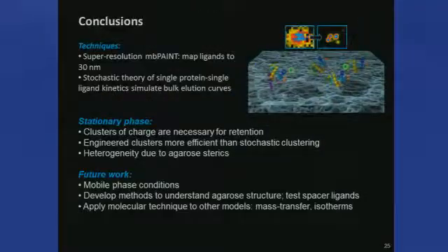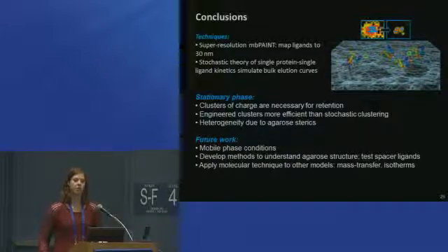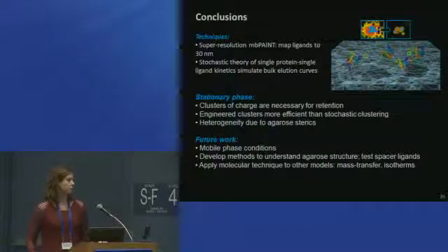And so with that, I'll wrap up and say, given I've just started my transition, that you can use lots of interesting advanced spectroscopy to learn new mechanistic detail about processes that are important historically, but even increasingly more important to the separations community. And you can learn things about all pieces of this process. You can learn something about the mobile phase in terms of the protein and its structure, the stationary porous support, if you're interested in that, and also in the orientation and the placement of the functional ligands within that support. And those are things that we are interested in studying in the future.